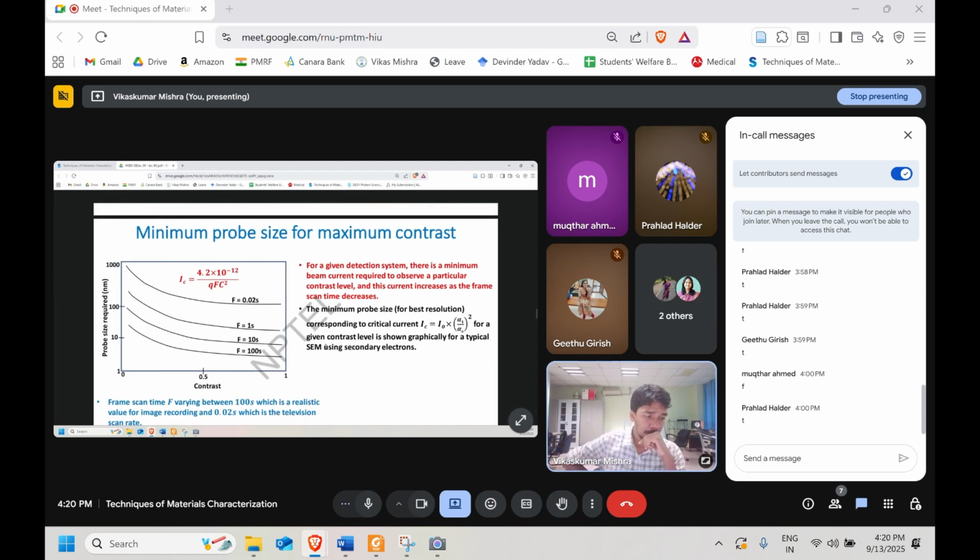So you want something practical. Yeah, practically we may be interested in magnification, or sometimes we are interested in resolution, or maybe in the contrast. Practically we may come to this objective. So at that time, what is the skill required to fine tune, and in which area? This is the most important thing for me to know.